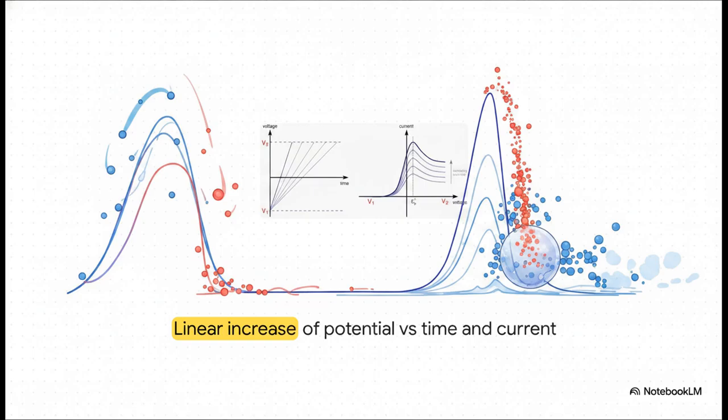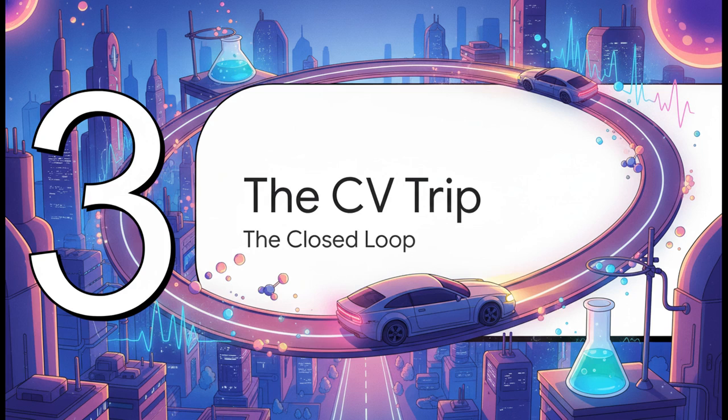Eventually though, and this is key, we run out of fresh molecules right at the surface of the electrode. They've all been converted. So what happens? The current hits a peak and then gradually trails off as new molecules struggle to swim in from the bulk solution. But what happens if we don't just stop at the end of that one-way street? What if we decide to turn the car around and come right back?